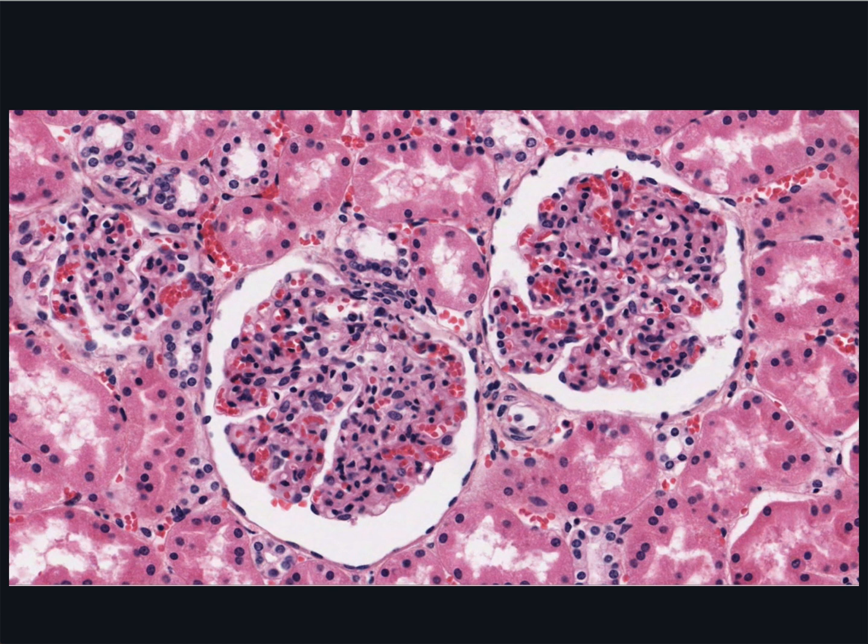Because you're viewing a renal corpuscle, most of the almost circular profiles of tubules you can see here, close by, are proximal convoluted tubules. They follow a very tortuous or convoluted path until they enter the medulla as a proximal straight tubule, then a descending thin loop of Henle.